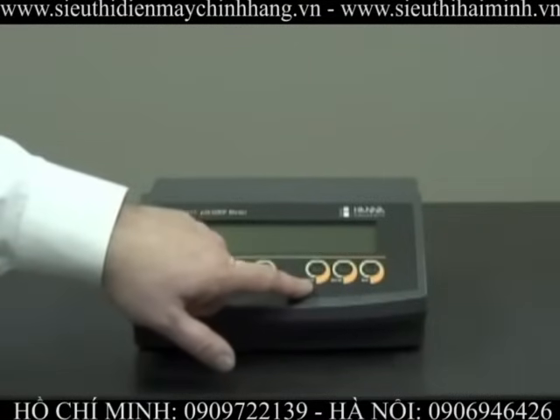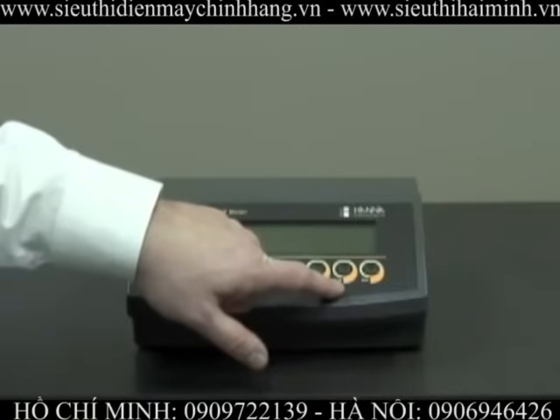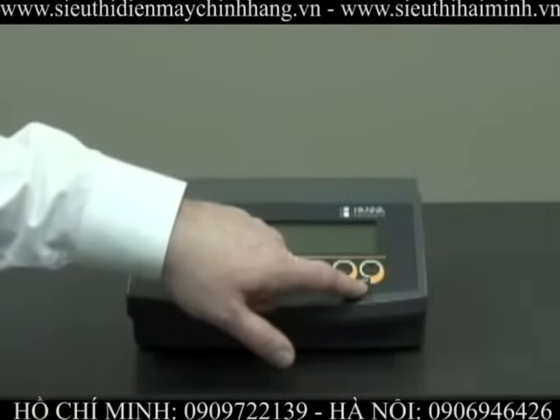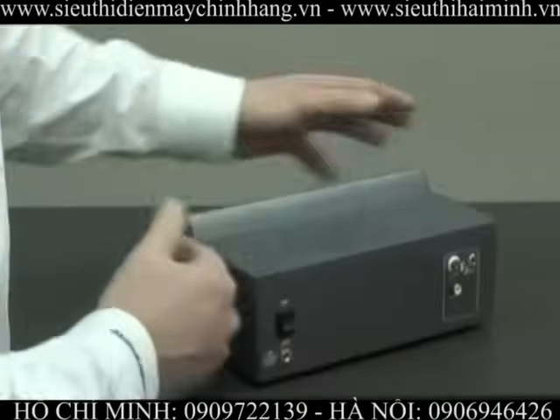We have the range button, which will display pH and millivolt. We have a memory button to store the last reading, and a memory recall button to pull up the last reading.